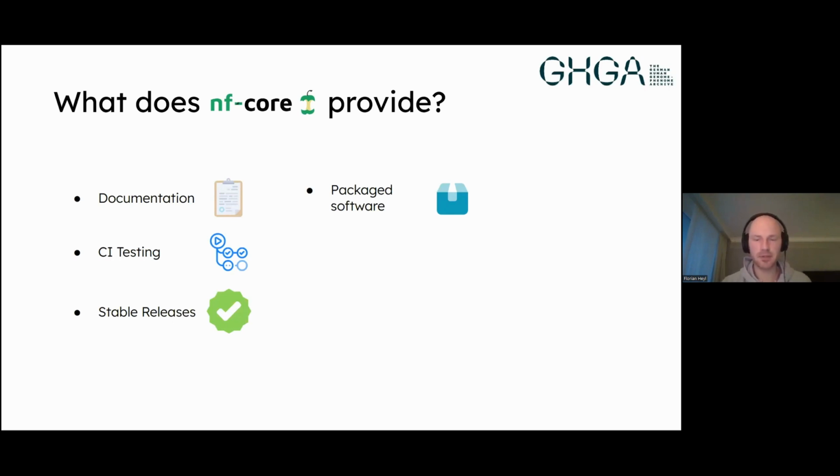This helps with shipping your software from one computer or environment to another and make it runnable, and runnable in a way that you can reproduce your data, your results. And that's what packaged software stands for. Yeah, so portable, reproducible, and Nextflow is also able to make the workflows cloud ready.